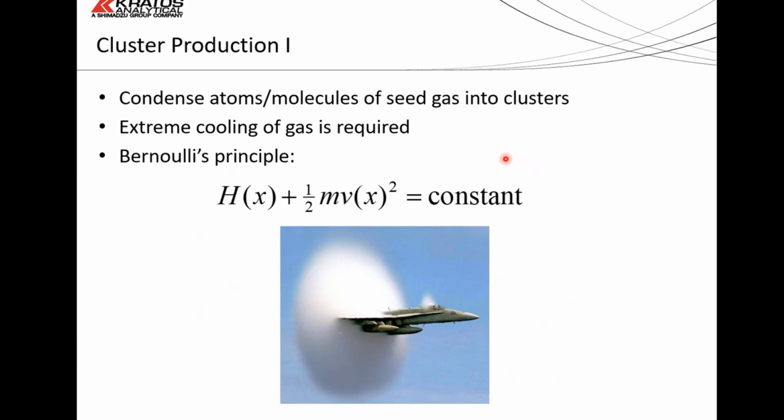So how do we get our little fragments of argon into an electron impact source, which you have to hold at a kind of medium vacuum? We start off with an argon cylinder, and we charge that argon cylinder and the outlet line to a few bar pressure, what we call the stagnation pressure. And at the exit to that outlet line, we have a nozzle.